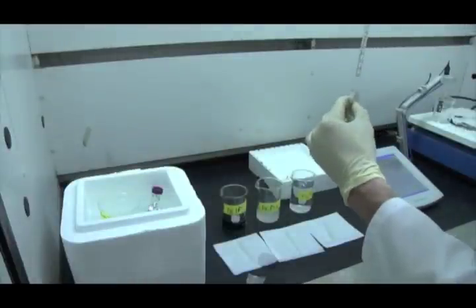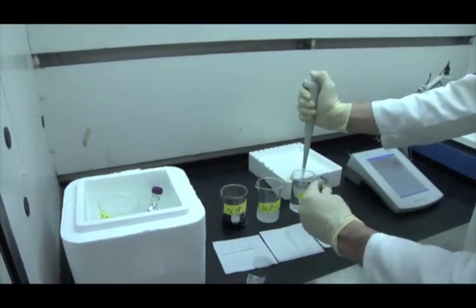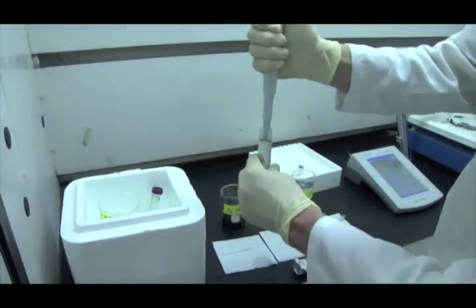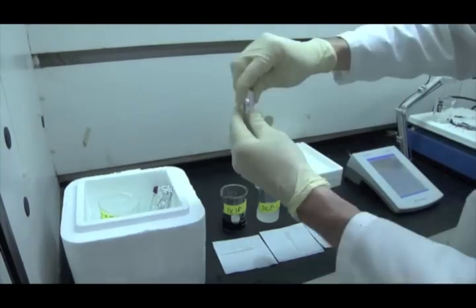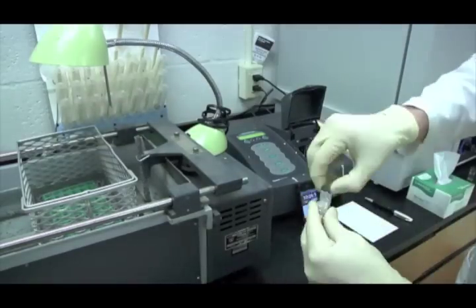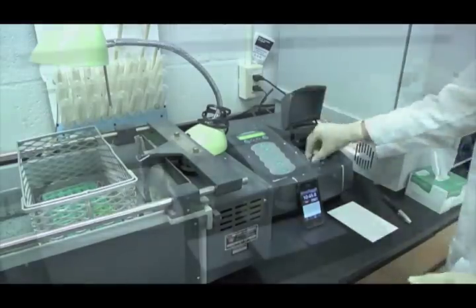A solution containing 1.75 milliliters of the tris NaCl buffer, 250 microliters of the DCIP solution, 250 microliters of distilled water, and 250 microliters of the chloroplast suspension was combined in a cuvette wrapped with aluminum foil to prevent the reduction of DCIP by illuminated chloroplasts. Serving as a control, the cuvette was placed in a 20°C water bath for 10 minutes, at which point absorbance of the solution at 600 nanometers was measured, and absorbance value recorded.